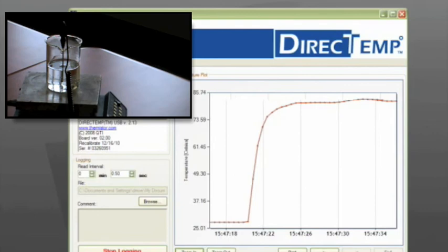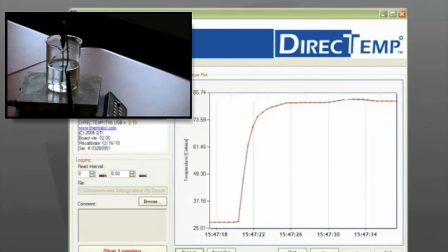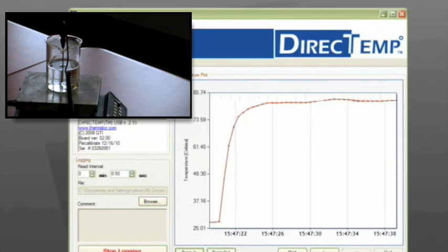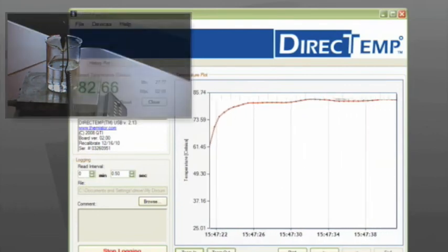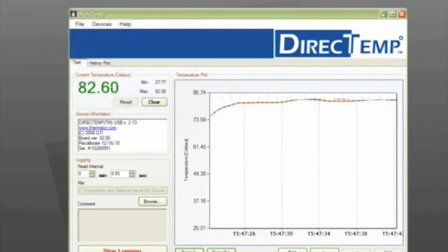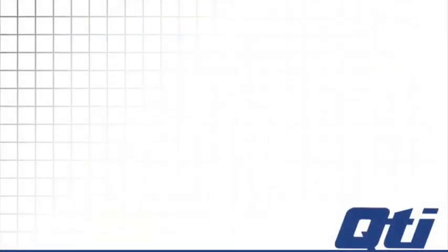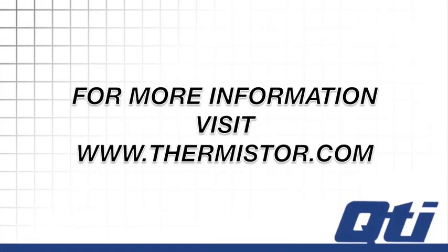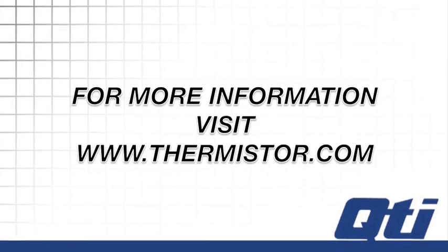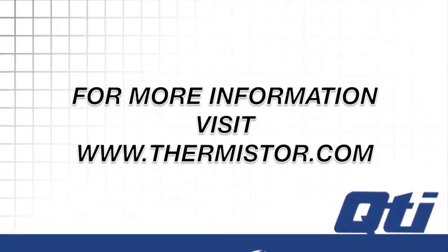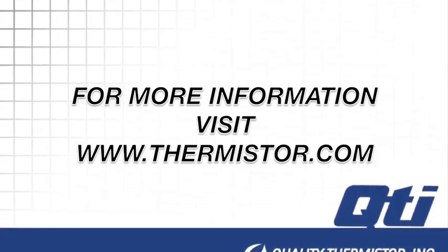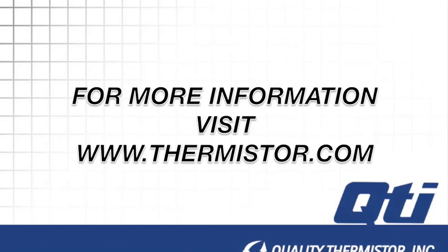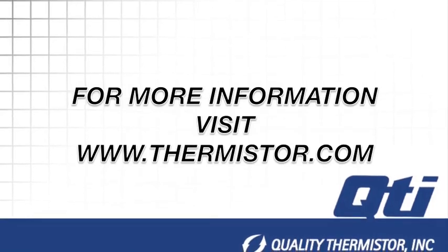This concludes our demonstration of the direct temp probe. Be sure to visit www.thermistor.com for more information on the direct temp family of sensors as well as all of your temperature sensing needs. Thank you.